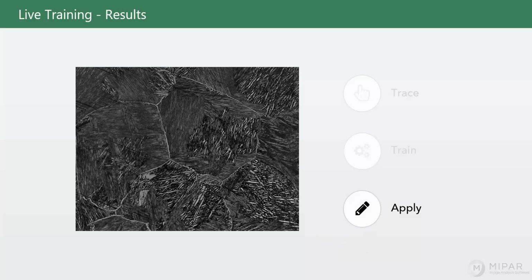So we've seen the deployment of a very powerful technology that allows great accessibility to take expert input from metallurgists and microscopists, continuing to do what they've done for so long by manually marking up their images, and then allow this deep learning training engine to take over from there, learn from it, and automate what used to be impossible problems. And we've been able to do so during the course of this webinar.